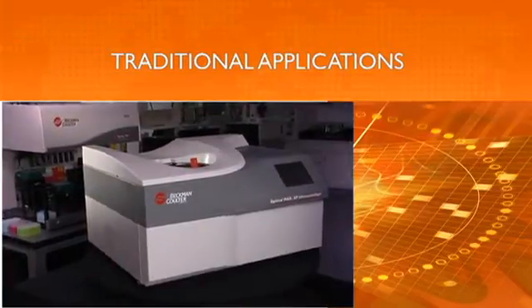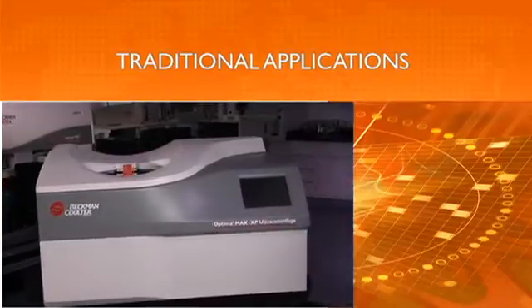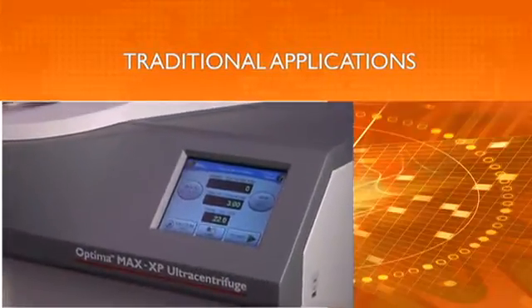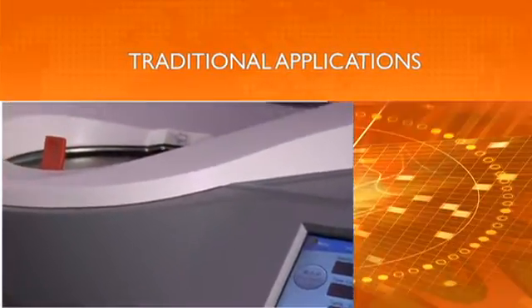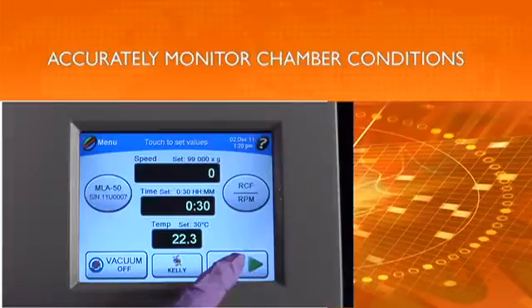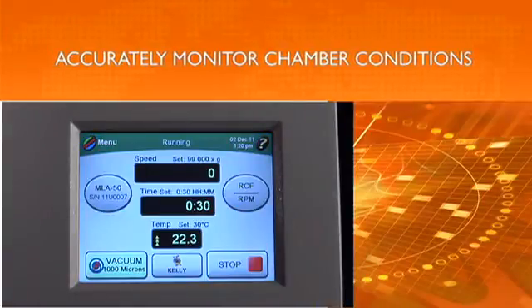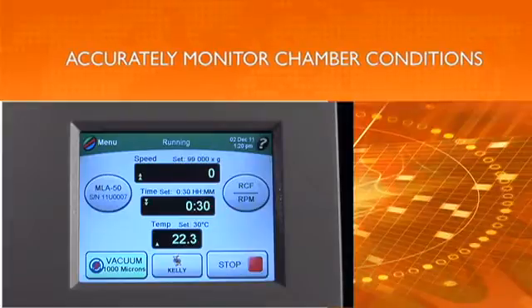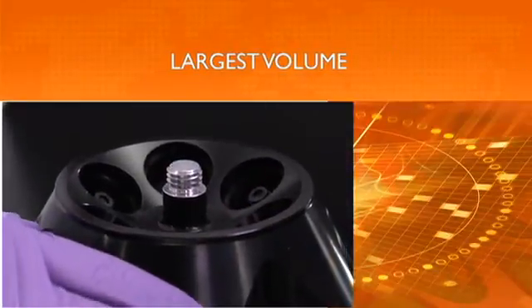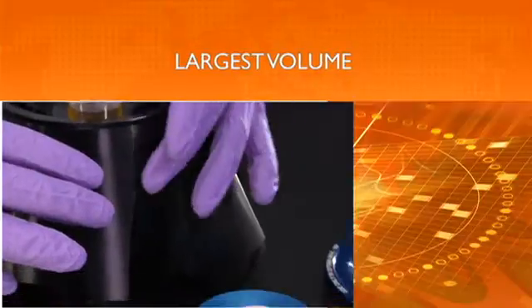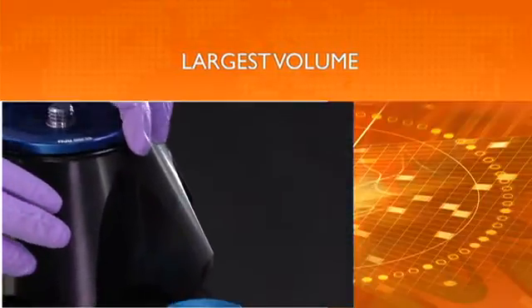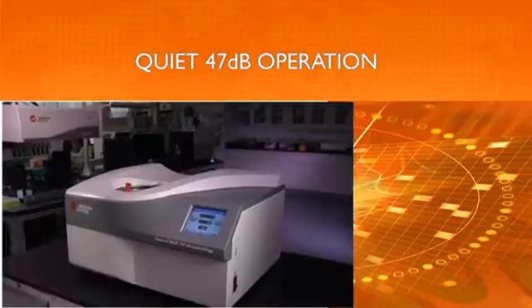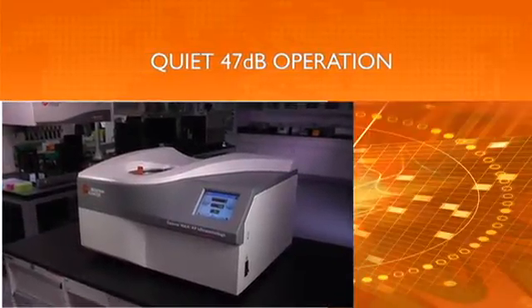The Optima Maxx series' unmatched efficiency and versatility also meet the needs of traditional laboratory applications, including separation of subcellular particles and protein purification and isolation. The Maxx series' on-screen numerical vacuum display allows you to accurately monitor chamber conditions prior to and during runs. And the Optima MaxxP offers the largest volume tabletop ultracentrifuge rotor available with 6 times 32.4 milliliter tube capacity. Plus, the Optima Maxx series has been optimized for quiet operation.